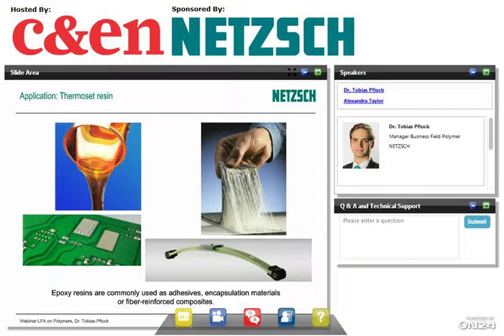This is true as well for fiber reinforced composites. While that's a whole different material, heat transport gets anisotropic. You have fibers as well. So this is actually quite a complex material. But if you have this inside some, let's say, heating profile, of course you would have to know the transport properties of this material.